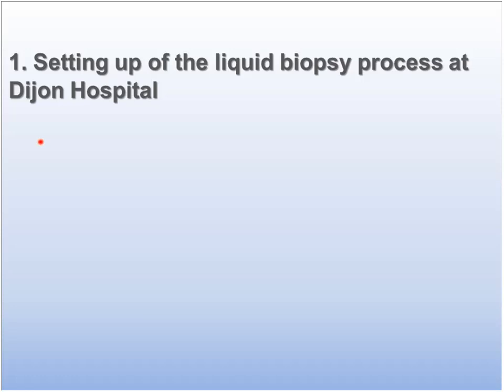So in the first part of my presentation, I will show you how we set up the liquid biopsy process in our platform.